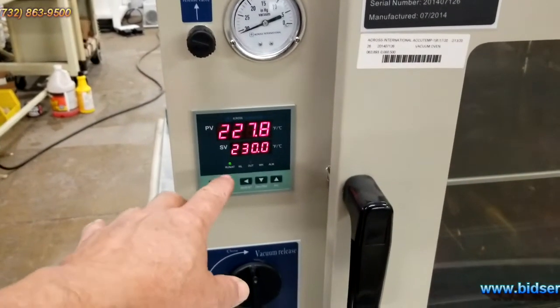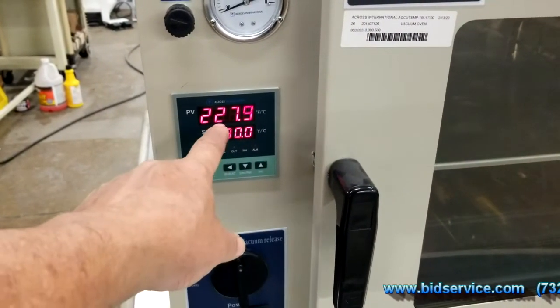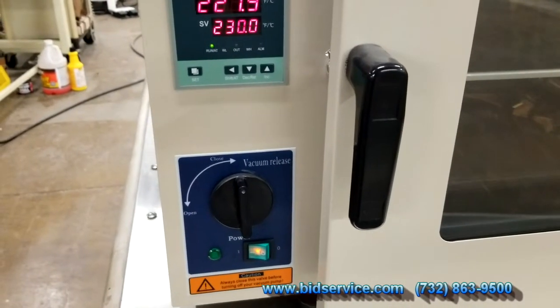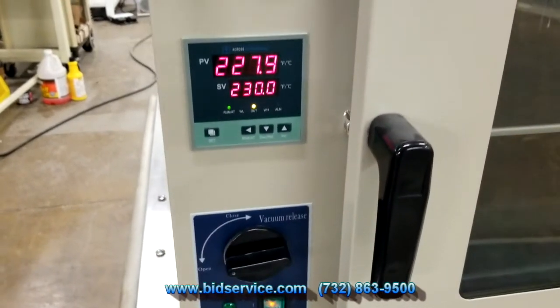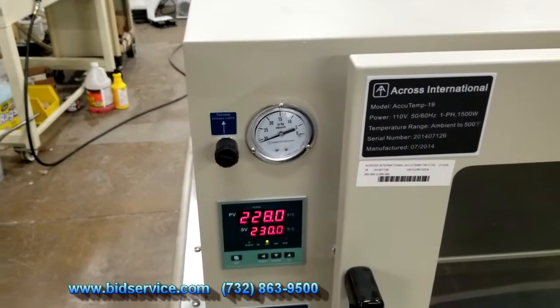Down below here is your temperature controller, set for 230, and it's right now at 227.9. Down here is your opening and closing for your vacuum — I actually have it closed, but I'll open it up. This thing has basically been holding vacuum overnight.